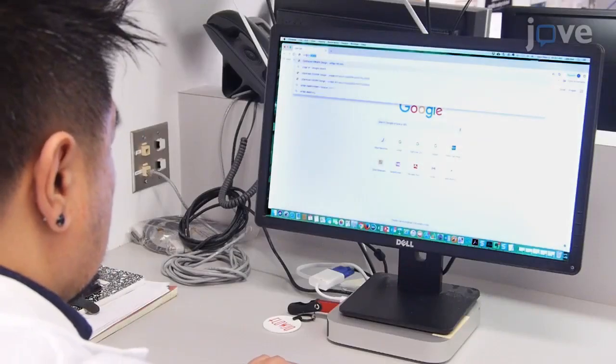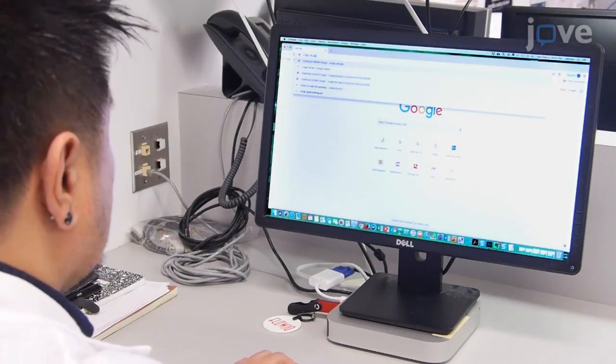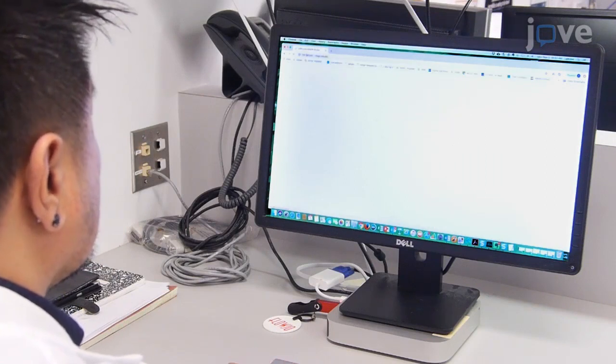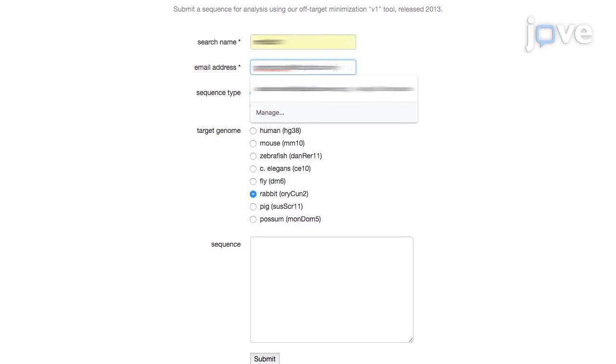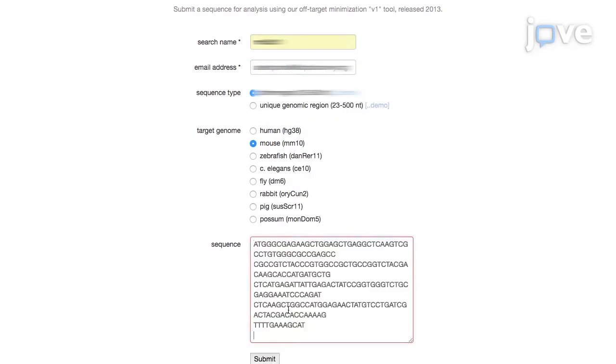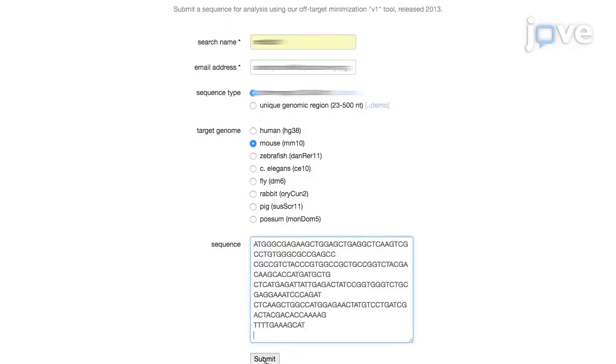A web-based CRISPR design software is used to design 4-6 single-guide RNAs for the gene of interest. To begin, fill in the appropriate information in the fields with asterisks. Then select the target genome for single-guide RNA design, paste the target sequence in the sequence box, and click on the submit button.